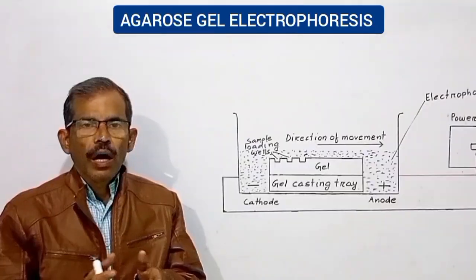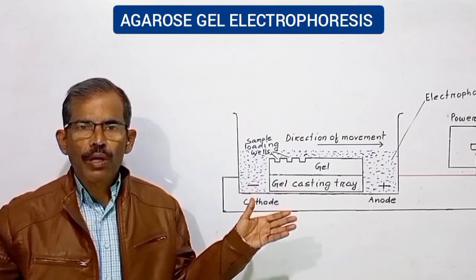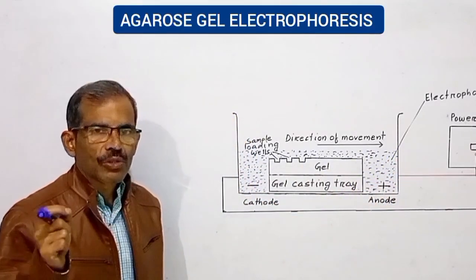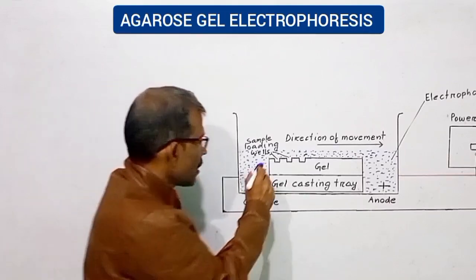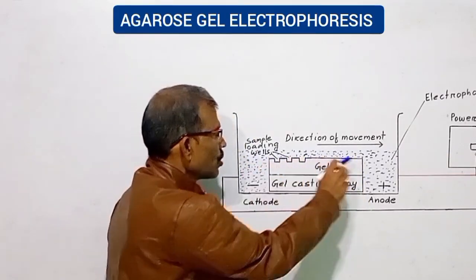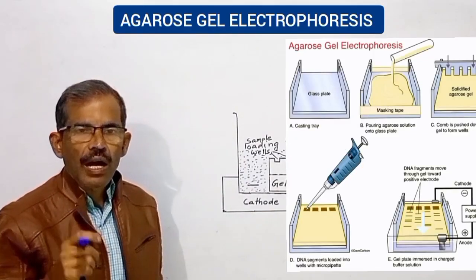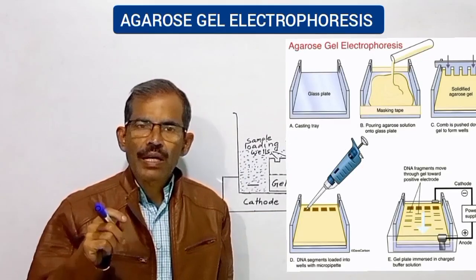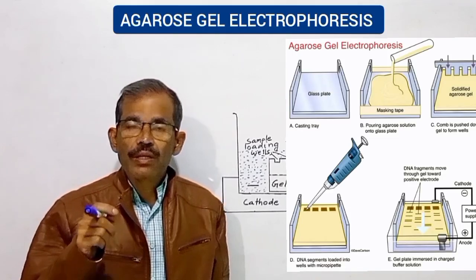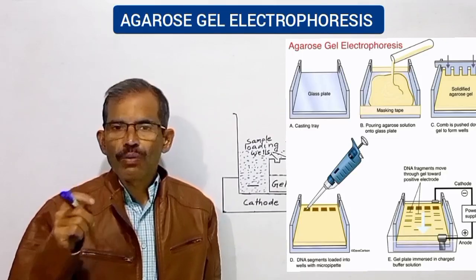Agarose gel electrophoresis is most commonly performed horizontally in subaqueous mode, in which the slab gel remains completely submerged within the running buffer. For making gel, dry agarose is suspended in an aqueous buffer and the suspension is then boiled until a clear solution forms.